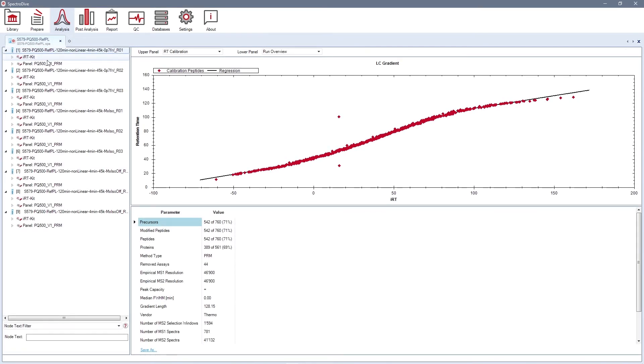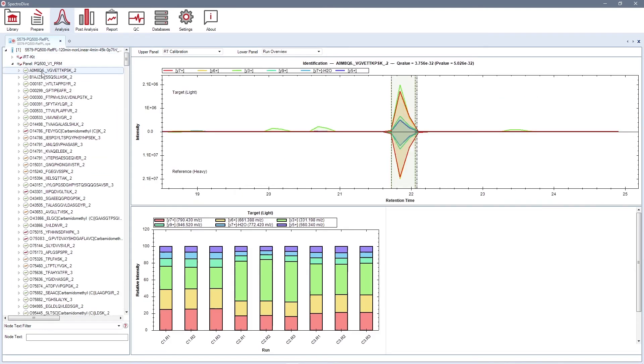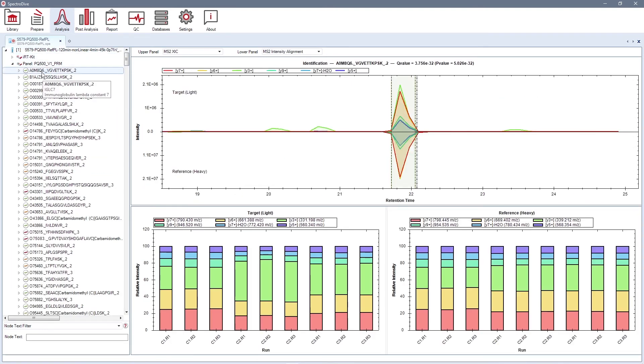Once the analysis is finished, SpectroDive gives you several powerful and easily accessible visualizations for browsing your data. For example, for the elution group, you can visualize MS2-XIC, where XIC signals for all transitions for both targeted and reference peptides are aligned and presented alongside.